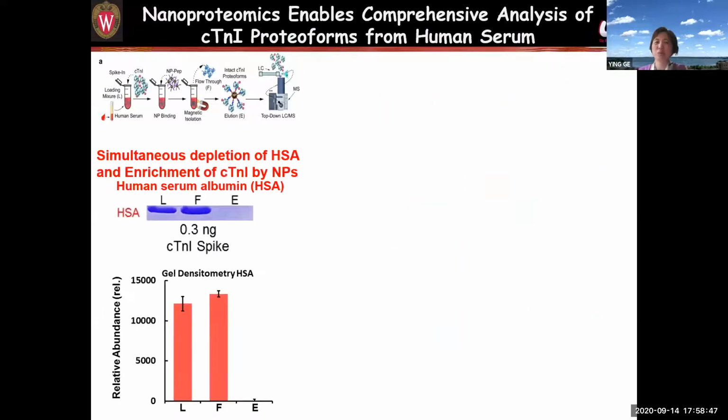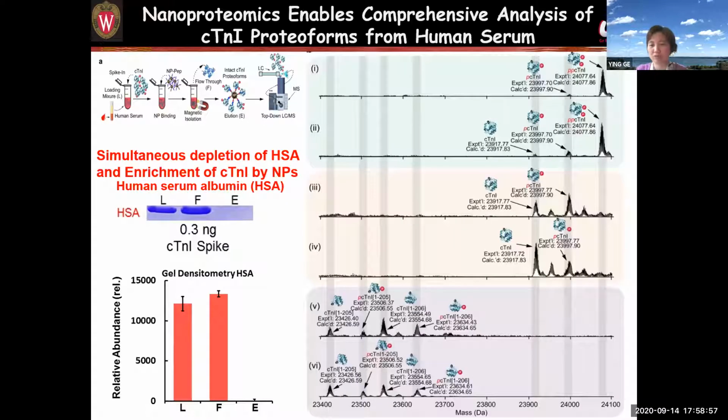As I said, quantitation of those post-translational modifications from tissues and blood is now possible. Of course, Ben Garcia's lab has done so much for the quantitation of histone modifications for epigenetics. I assume a lot of people are from Ben's lab here, right? Thank you. Ben has done wonderful work in the proteomics quantitation of PTMs, histones, epigenetics.